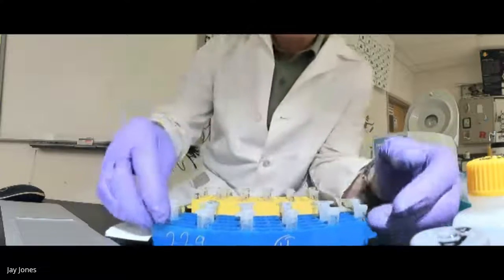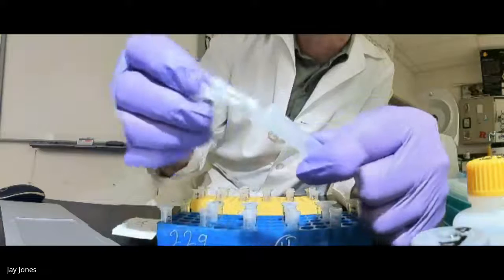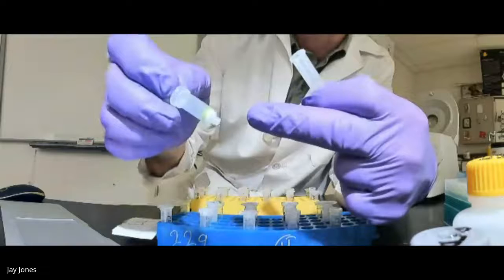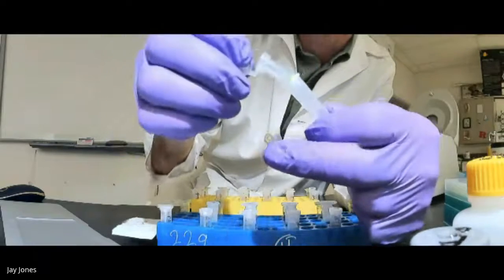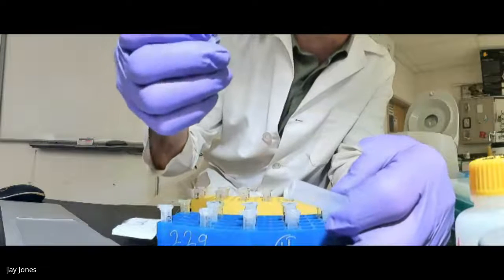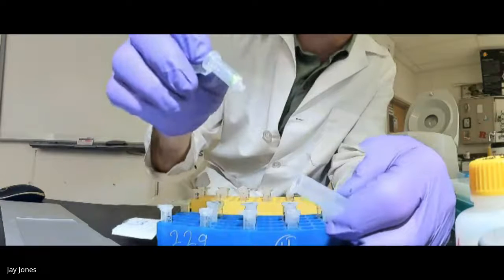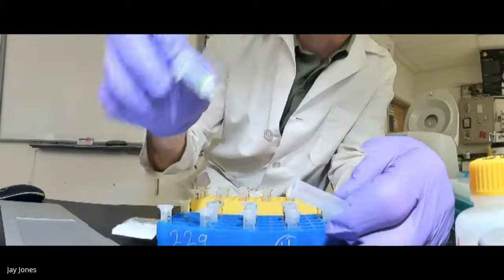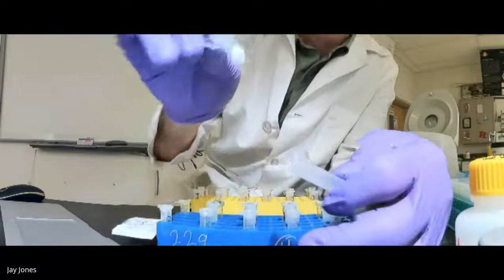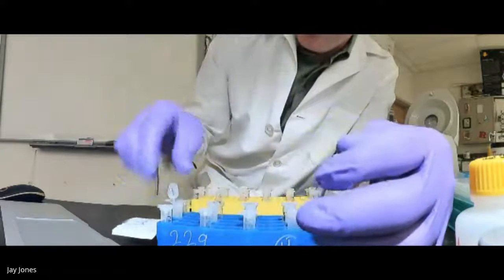So now we have to open up these things. These things are called spin columns. These columns do one thing really well. They grab plasmid DNA. They don't discriminate. They'll grab any DNA, but they're really good at grabbing plasmid DNA. They do it with a silica bridge that grabs phosphates. So if you have a lot of phosphates, a lot of negative charges, they'll grab it.